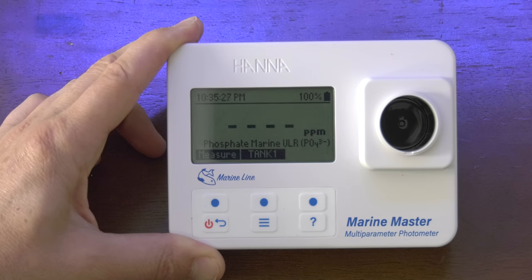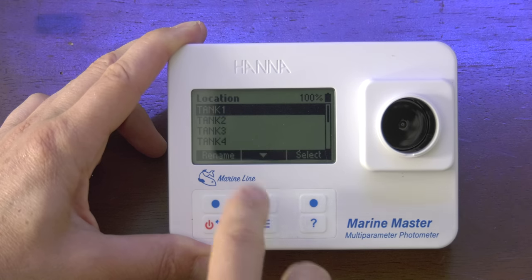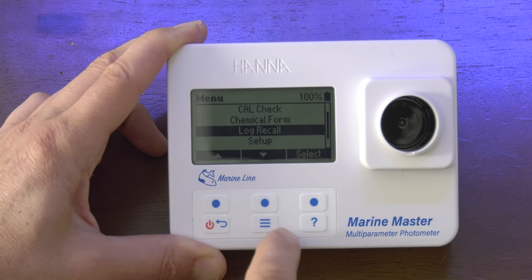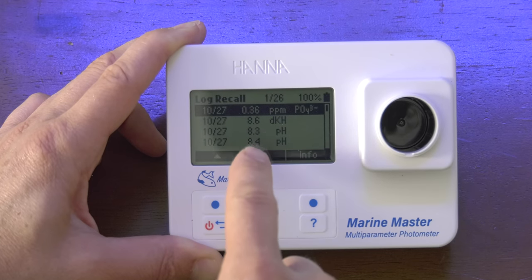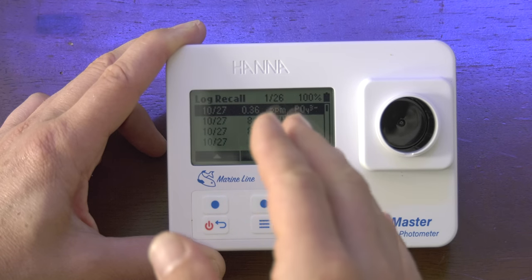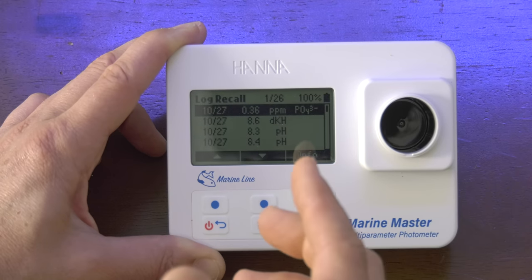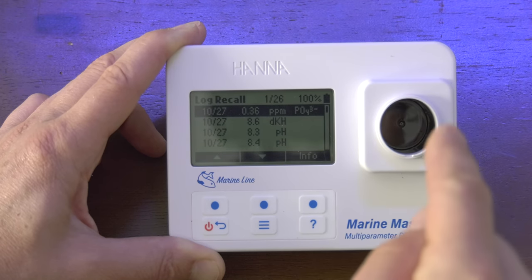Digging into the Marine Master photometer, I discovered something really cool. You can assign different tanks to the measurements — so say I'm testing my tank or a client's tank, I can log it right here in the meter. I'm going to go into log recall, and I can see all of my test parameters. I don't have to remember to write down the test results. Even if this thing turns off, the results are right here. I can scroll up and down and see all the test results stored even after it powers off.